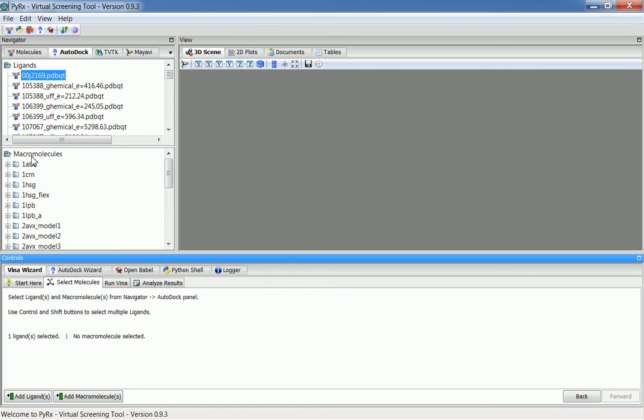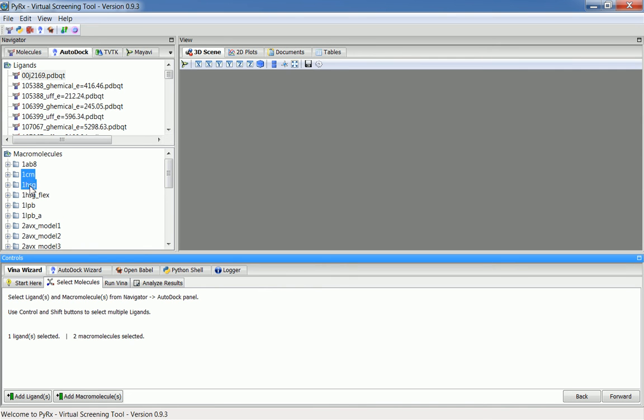Here I'll select two macromolecules, one CRN and one HSG. I'll use the Shift key together with mouse key. You can also use Control key to select multiple folders at once.